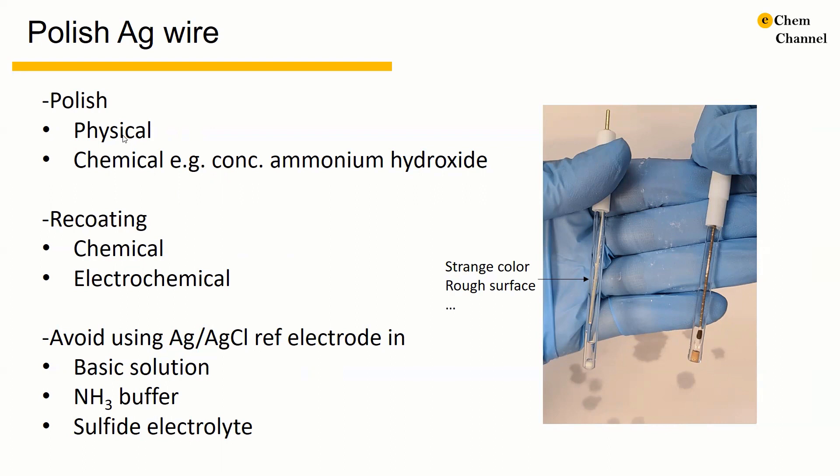We can do physical polish as well as chemical polish. For physical polish, we can simply use a fine sandpaper. For chemical polish, we can use concentrated ammonium hydroxide. Then we need to re-coat the silver vial with silver chloride. There are two ways: one is a chemical method and the other is an electrochemical method.